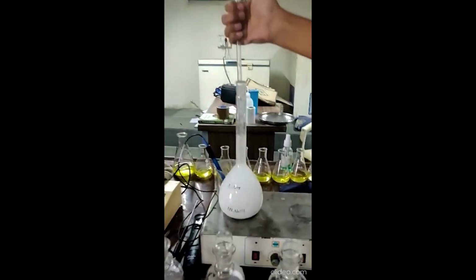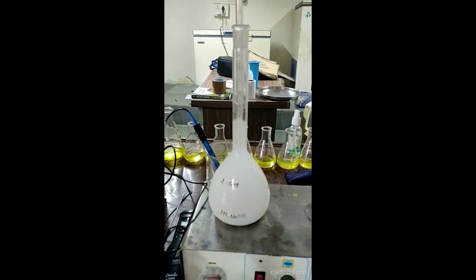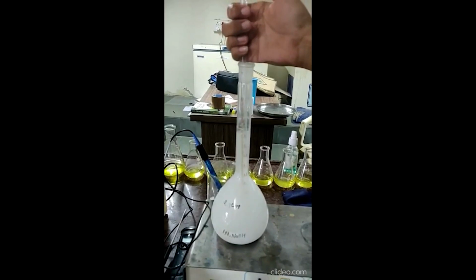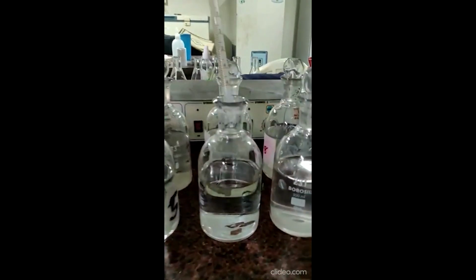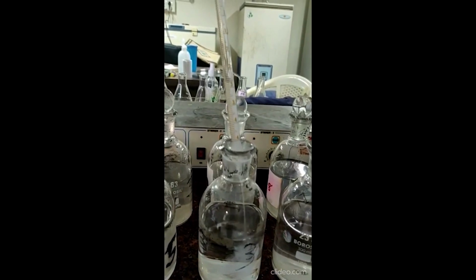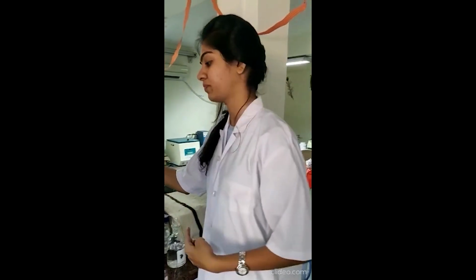For example, here we are adding, we'll take it in the pipette and we'll add it in the BOD bottle. Similarly, we'll do it for all the bottles, varying the concentrations in the BOD bottles.